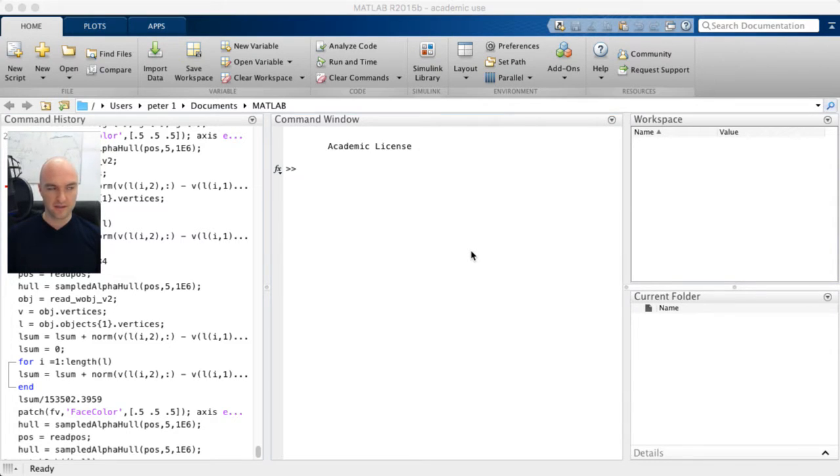Of course, that means going beyond what you can usually do with commercial software, mostly because we work a lot on interfaces and on weird chemistries. You really need to be able to dig deep into the data to get to the bottom of things.